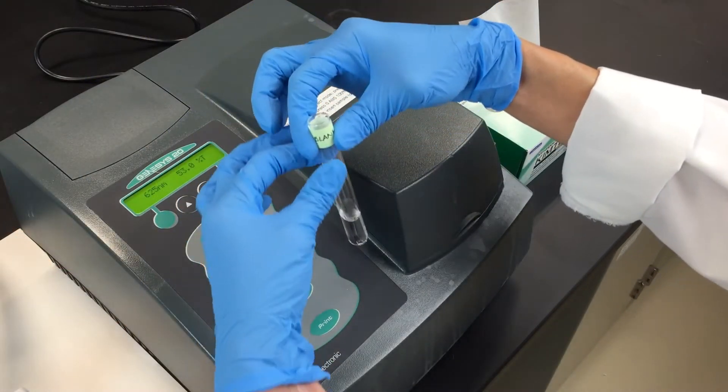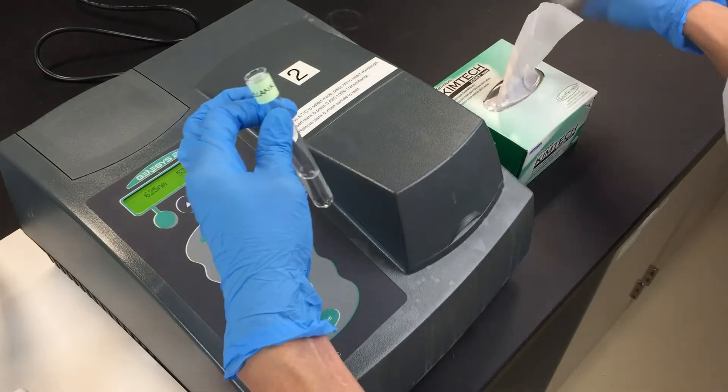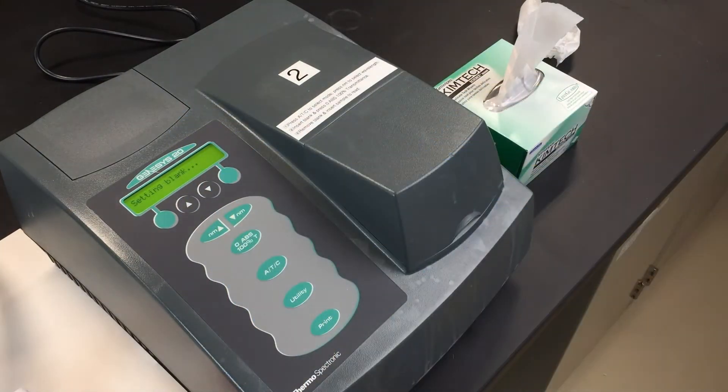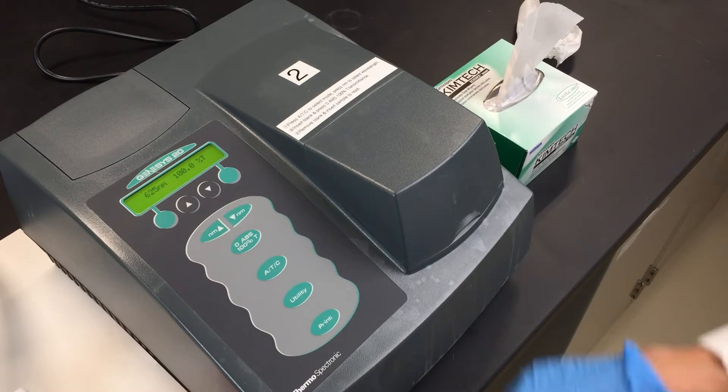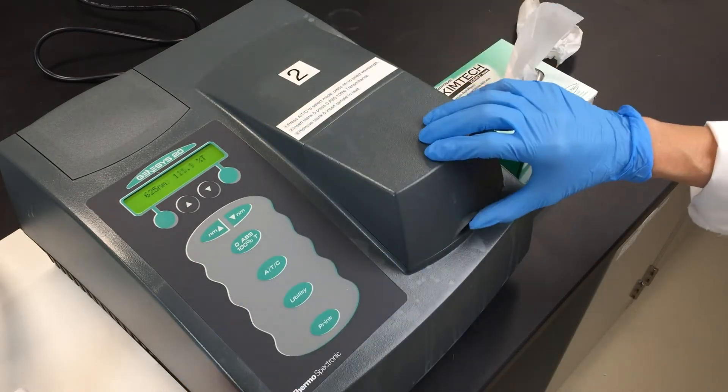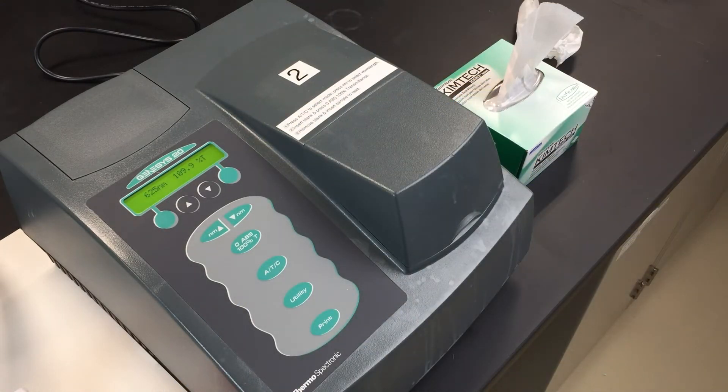Wipe any fingerprints off the blank tube and place it in the spectrophotometer. Press the 0 ABS 100% transmittance button to blank your spectrophotometer. Once you've blanked it, you don't have to do it again.